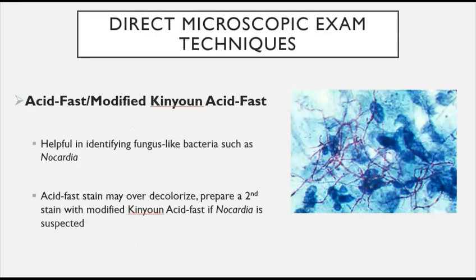Another stain is acid fast stain or modified Kinyoun acid fast. It's helpful in identifying a fungus-like bacteria such as Nocardia. Acid fast stain may over-decolorize, so prepare a second stain with modified Kinyoun acid fast if Nocardia is suspected.